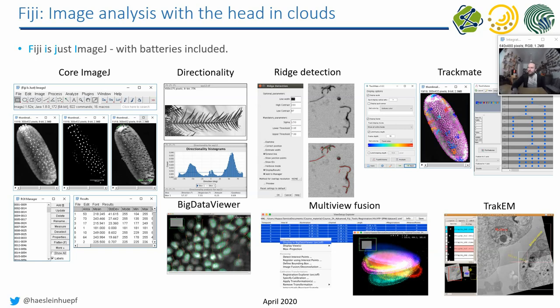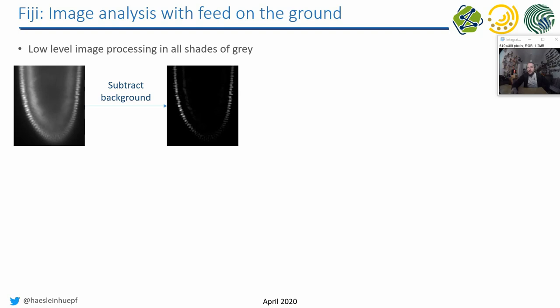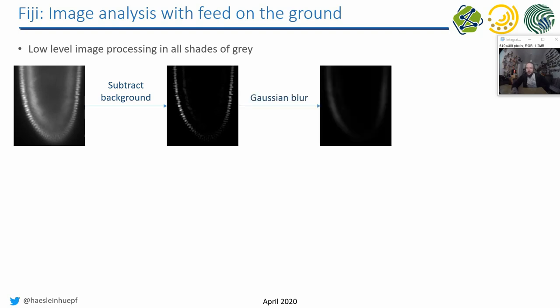So you see, Fiji contains quite sophisticated plugins which can solve many different kinds of scientific questions. On the other hand, you also have low-level image processing tools. For example, starting from an image showing a 2D plane through a Drosophila embryo, you can subtract the background, apply a Gaussian blur — operations you will learn in the next lecture — and then divide one image by the other to see the objects more clearly.